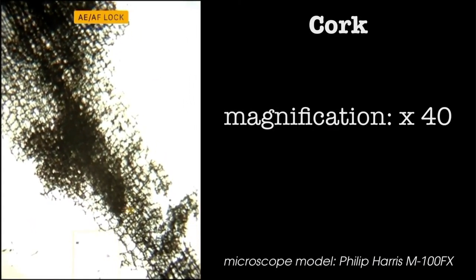Here's a selection of videos I was able to record using various microscope slides that we use in school.